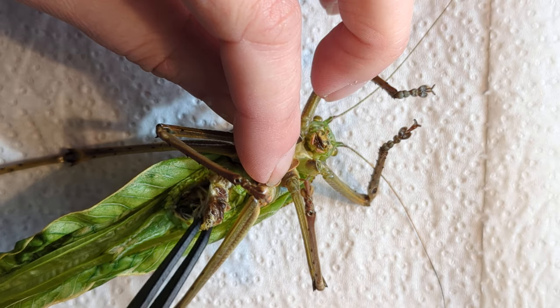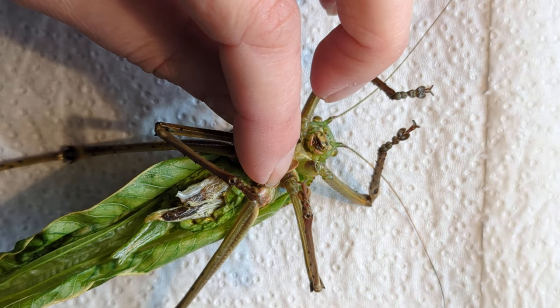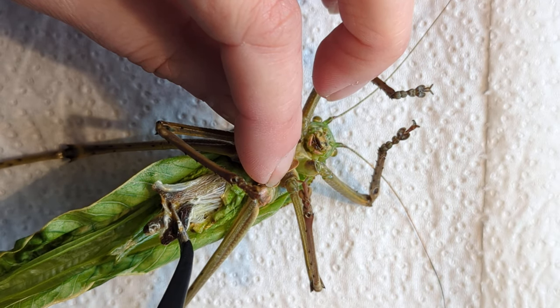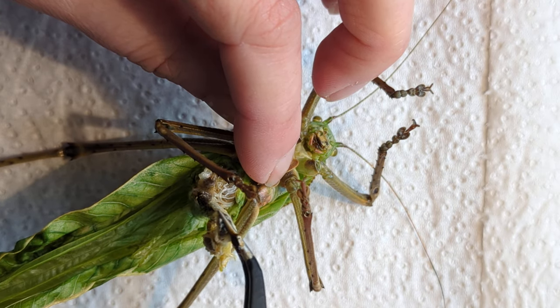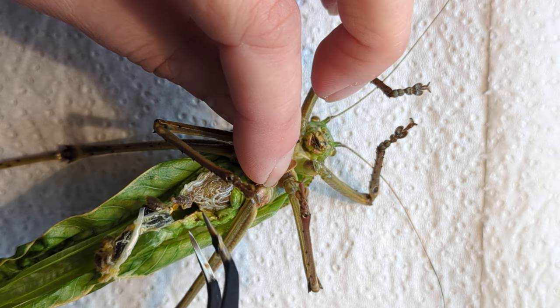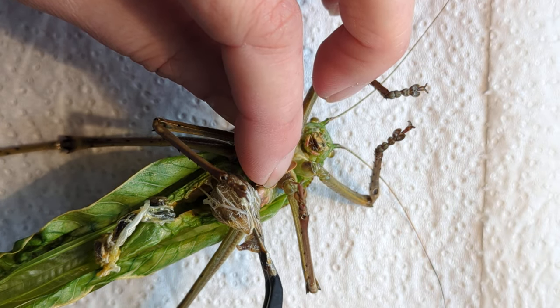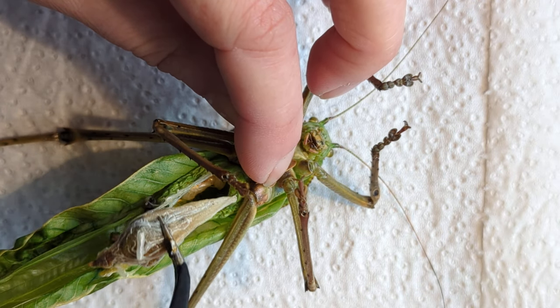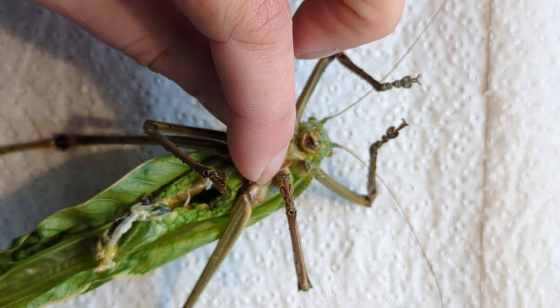This is the digestive tract — this is going to be a bit gooey. You have to get all the way into the thorax to get everything out. There's a great big food bolus in there — delicious leaves!